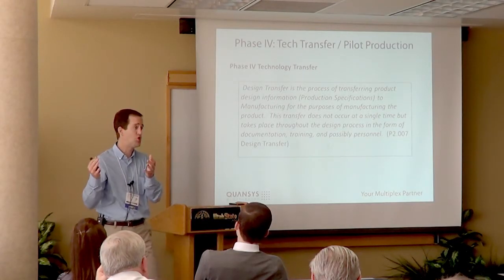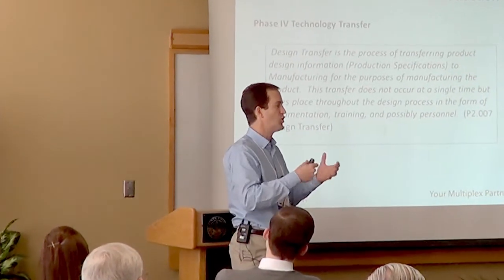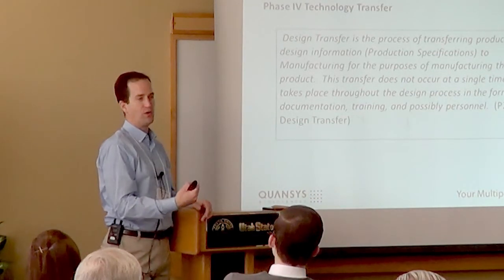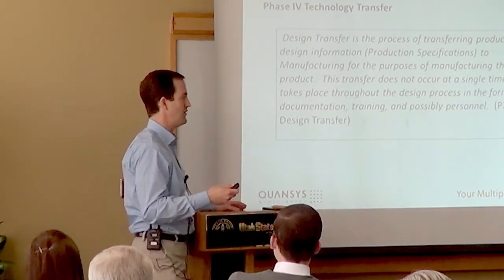So we will actually take an R&D technician who oversaw the project, and they will go work side by side with the production technicians to ensure that all of that knowledge that we accumulated during development of that product gets transferred to the production team to ensure that when they now go and produce this product, it performs the same as it did in phase 2 and in phase 3 in our development process.